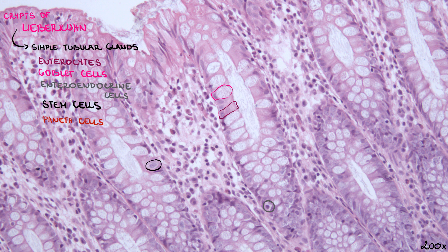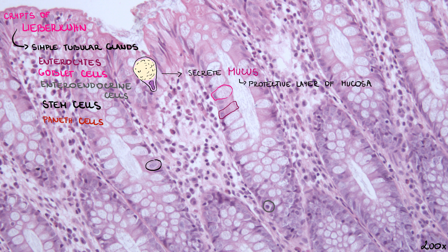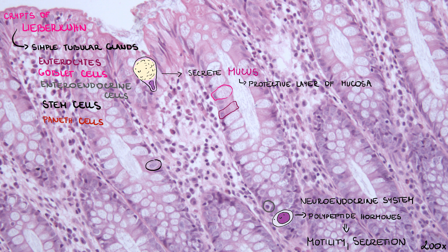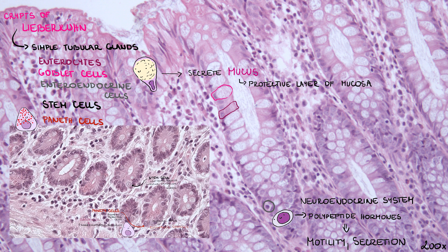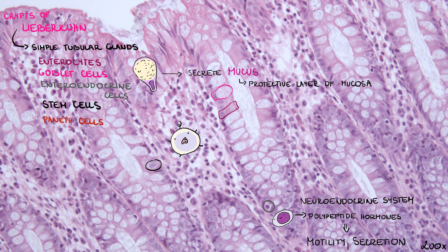Goblet cells are rather common in the large intestine, and they become even more numerous as the large intestine reaches its last segment, the rectum. These cells secrete mucus, which serves as a protective layer of the mucosa. Enteroendocrine cells belong to the neuroendocrine system and produce polypeptide hormones which influence motility and secretion of the intestine. Paneth cells, in comparison to the small intestine, are less numerous and cannot easily be distinguished in this section. Stem cells with light, active nuclei give rise to all aforementioned cell types.